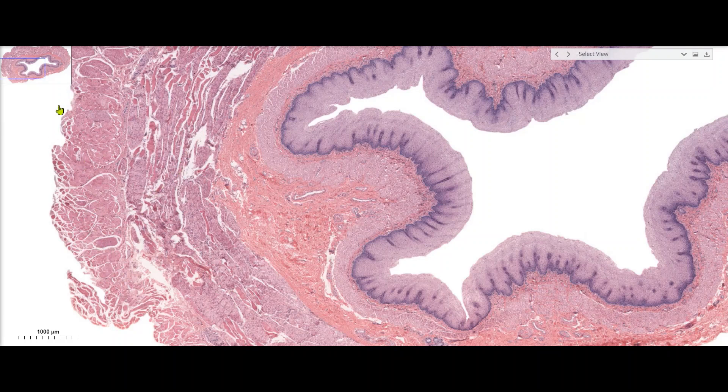Around the outside of the esophagus, our last and outermost layer would be called an adventitia, though it's not present on this slide. An adventitia is fibrous connective tissue that helps blend in and support the esophagus — it blends into the surrounding tissue and essentially anchors it in place.